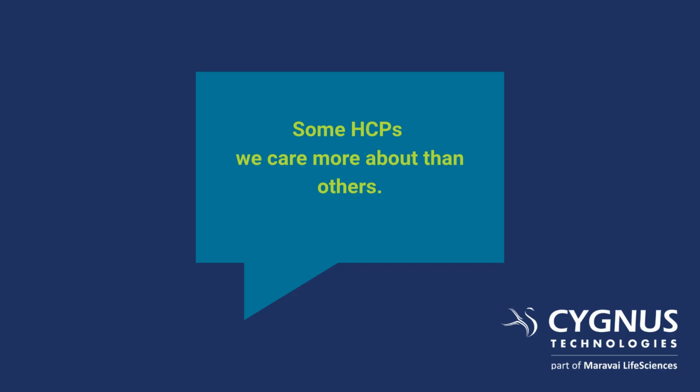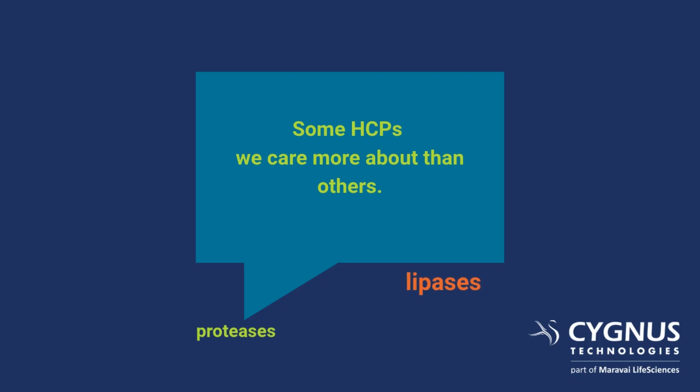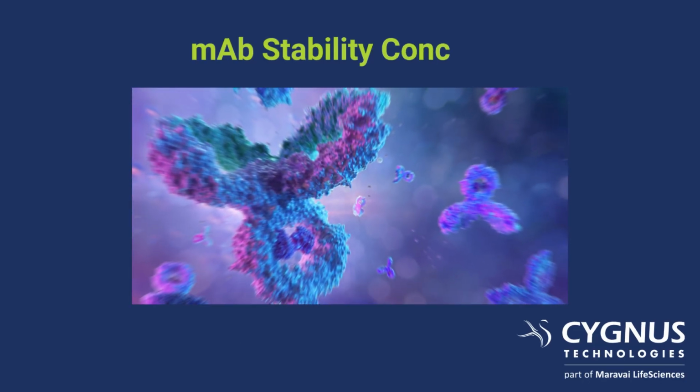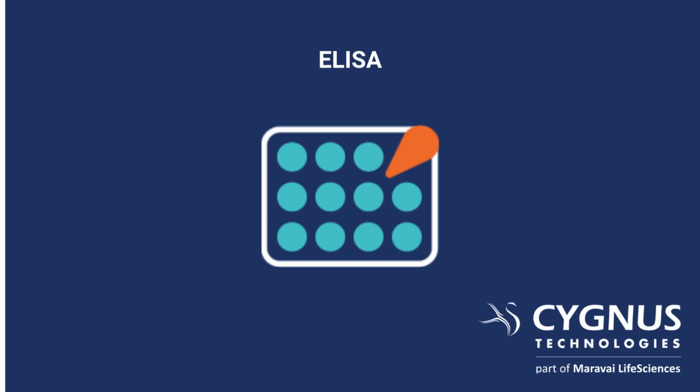Now, we monitor the general amount, but the real headache? Specific types, especially lipases. See, even tiny amounts can chew up stuff like polysorbate, wrecking drug stability in just months. A serious problem. First up, why usual methods fall short.